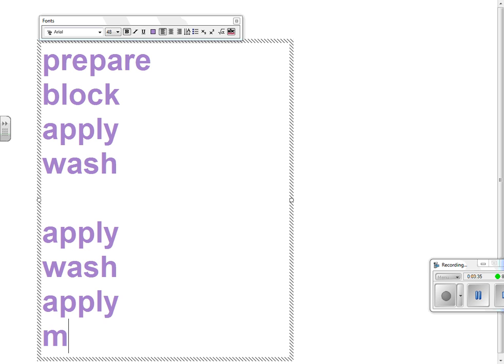So the last, again, is measure. Measure the absorbency or the fluorescence or electrical chemical signal of the plate wells to determine the presence and quantity of an antigen. And this is basically ELISA in a teeny tiny shell, and you can see that these words and steps repeat.